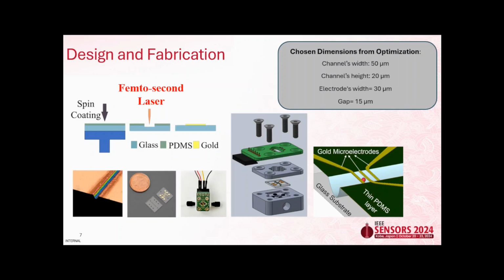And then the second part of my system will be fabricated using a normal photolithography process using gold and titanium as adhesion layer. And then these two separate layers will be sealed together using that thin PDMS layer in between. And all this sealed system will be mounted on a holder together with a PCB for my detection.